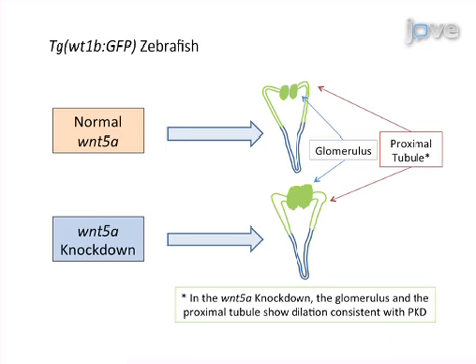pronephric kidney structures. The implications of this technique extend toward building a model of cystic kidney disease, because the transparency of the zebrafish embryo, coupled with the use of kidney-specific fluorescence protein transgenics, allows a direct view of kidney structures in a live organism. This method can provide insight into wnt5a knockdown causing zebrafish kidney cyst formation.